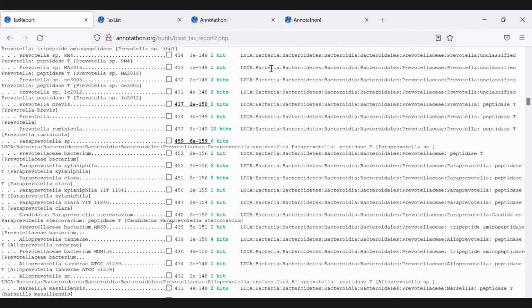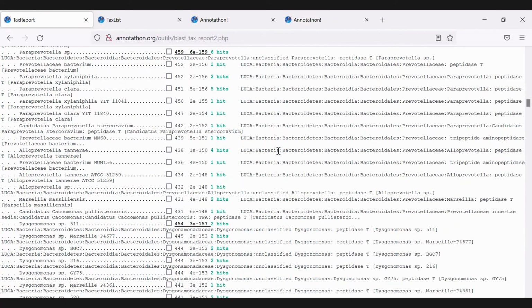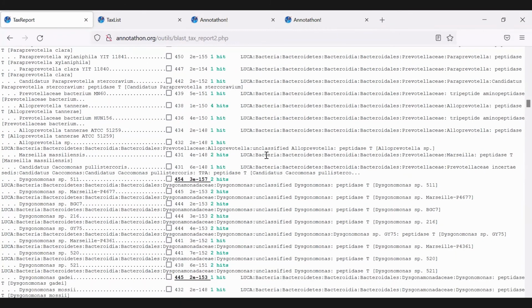It will take the first one and the second one. So it cuts on this line, and then it counts the number of lines that appear for this one and this one. And in some cases, when you have non-report, I guess it will be unclassified.